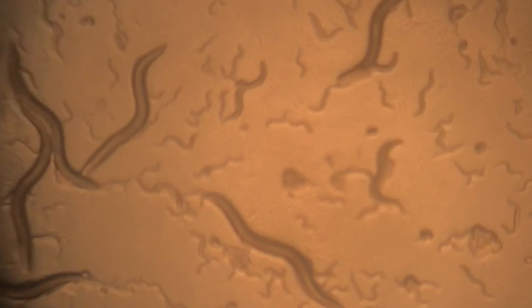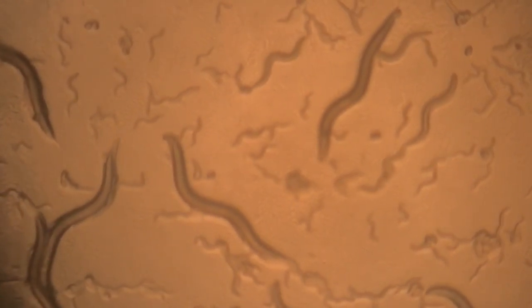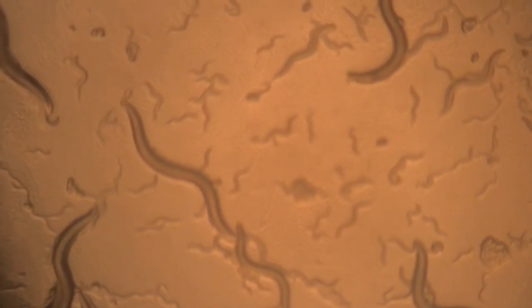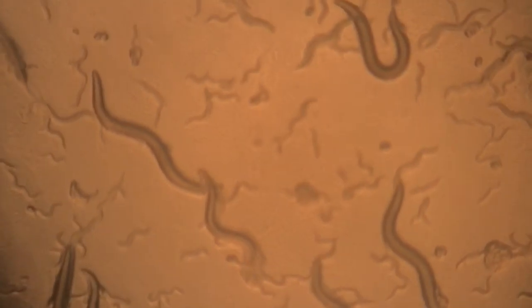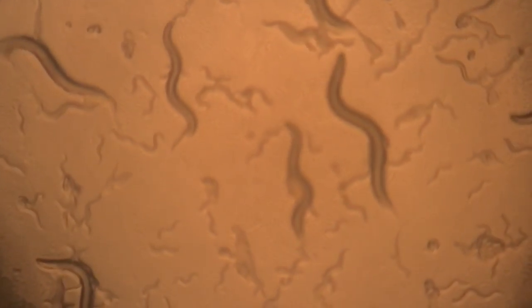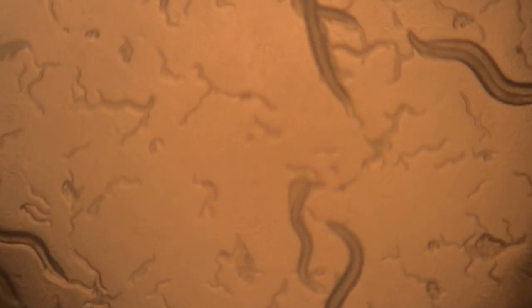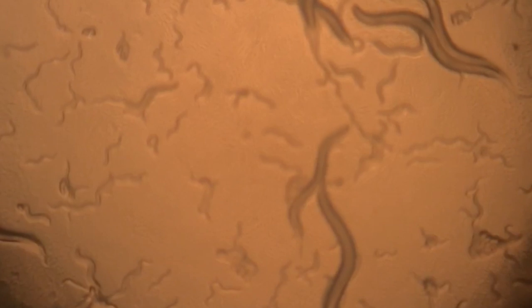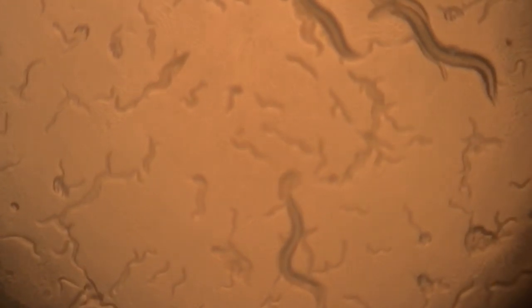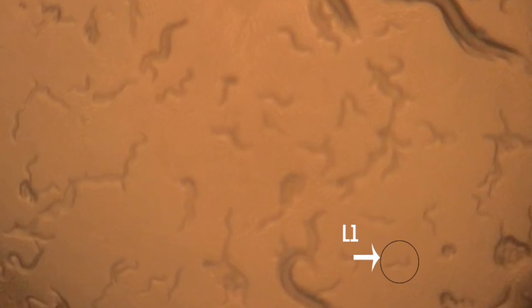Today, we will explain how RNAi can silence a gene in C. elegans. The C. elegans are essentially little worms that eat bacteria. We will be giving them certain bacterial strains to change their phenotype and silence a gene within them. The purpose of this lab is to study the C. elegans and observe the differences between the phenotypes in the wild type and the altered C. elegans.